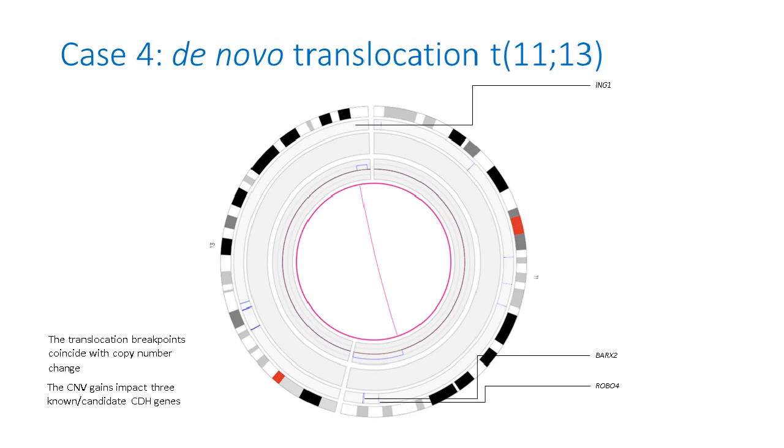I'll mention also, it was shown in the previous slide, but there are some interesting CDH candidate genes that are in both of these regions involved in the duplication.